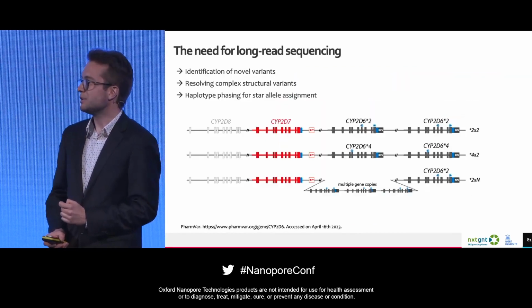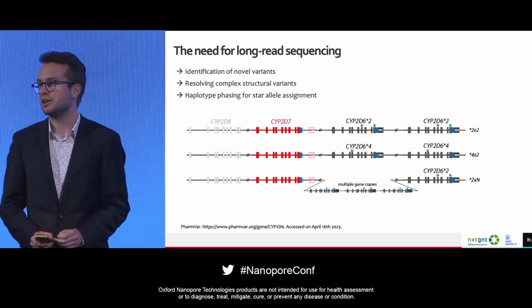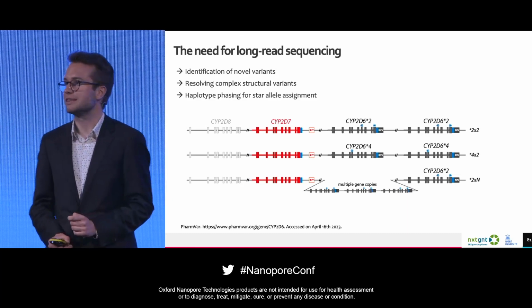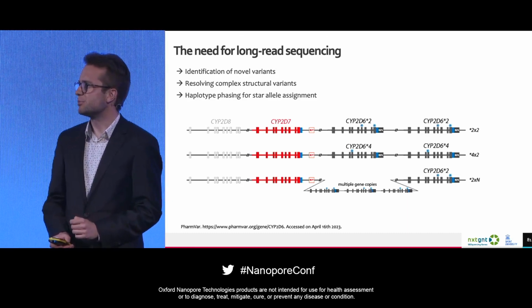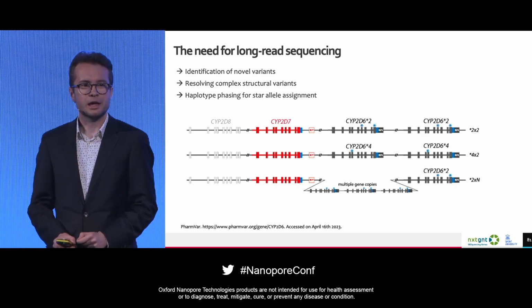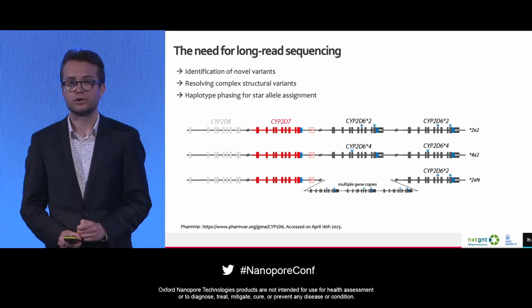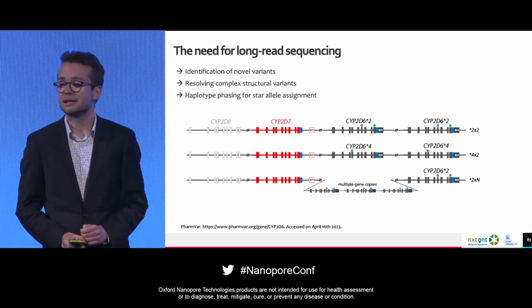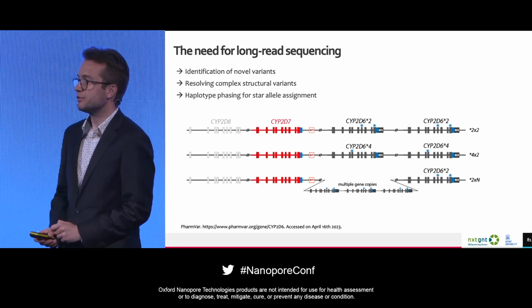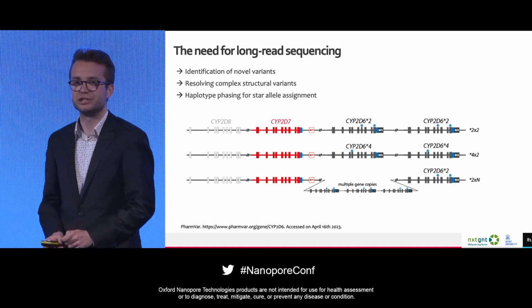However, the way we currently perform pharmacogenomics is mainly based on microarray and PCR-based techniques. While these techniques are great at resolving single nucleotide variants, they miss a large proportion of the biological information. To start with, as microarrays are inherently probe-based, they only screen for known and common variants. Secondly, for some pharmacogenes, we observe large structural variations, as for instance for the CYP2D6 gene.